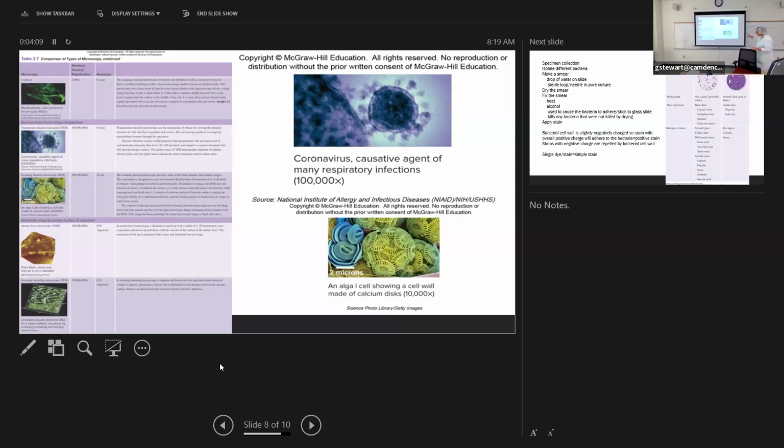All right, this next box is electron microscopes. So that's like a whole other level of microscopy. And they generally come in two formats, okay? One that we call the transmission electron microscope and one that we call scanning electron microscope. And then there are modifications of those that do very specific things.